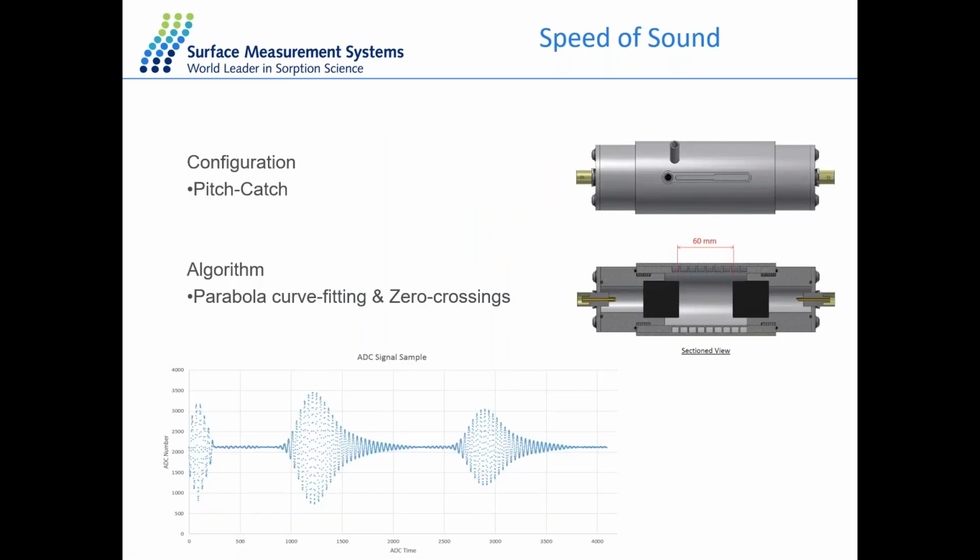I just mentioned the fact that we are using organic solvent, so I would like to take just a second to mention how we measure organic solvent. You can purchase instrumentation that allows you to measure relative humidity. Quite simply, they're available in the market. But if you want to measure organic solvent, it's a little bit more complicated. For that reason, we had to develop our own sensor to measure concentration of solvent in a carrier gas.